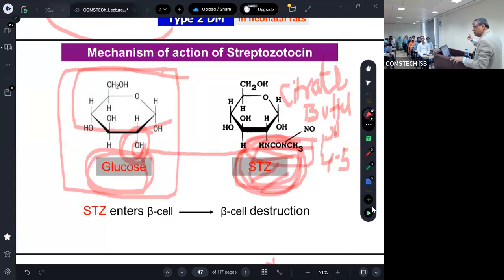So with this consideration, you have to make the solution in the animal house, number one. Number two, carry it within a proper carrier. Number three, don't make all the streptozotocin at a time, because after 2 or 3 minutes it degrades. If you make 10 ml, giving it to one animal takes at least 1 minute, two animals at least 2 minutes. If you can manage 1 rat in 2 minutes, make 1 solution for 2 rats. If you can't manage, make them one by one. It depends on your expertise and experience.